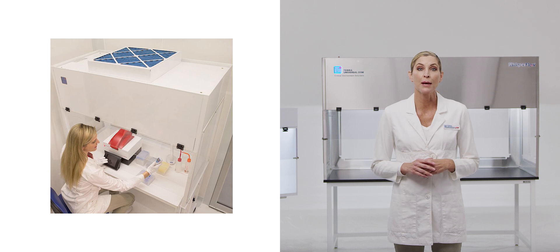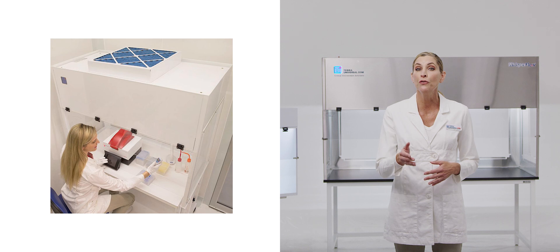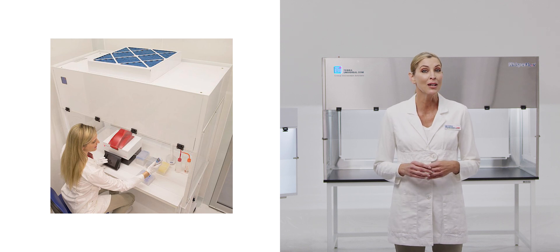Designed for gene target amplification, Terra's PCR hoods include an integrated germicidal UV lamp and handheld pipette organizer.